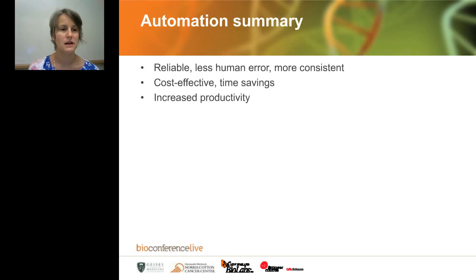So just to summarize my talk today, for us, automating these 2 protocols has resulted in less human error and more reliable library preps, in addition to the cost saving and the time saving. For the NEB, it has been cost effective since we're now not having to repeat libraries. And it does allow us to have one technician working on this and doing more library preps, and another technician can be doing something else.